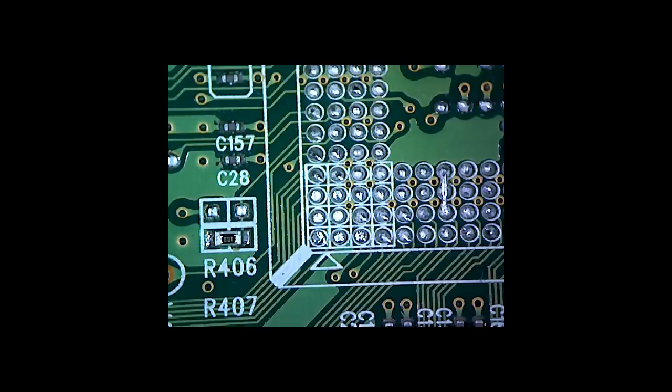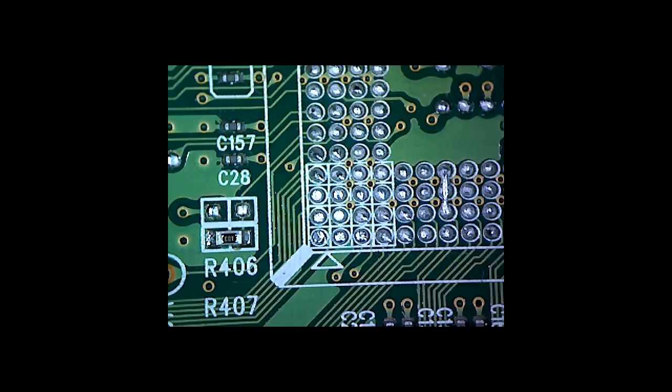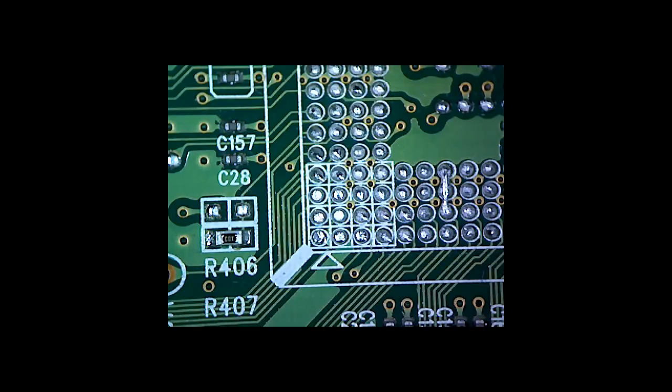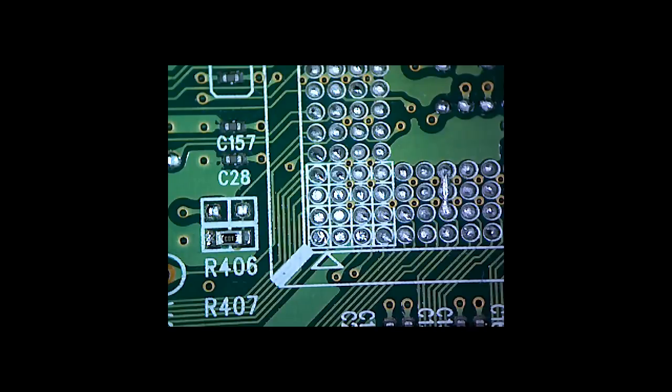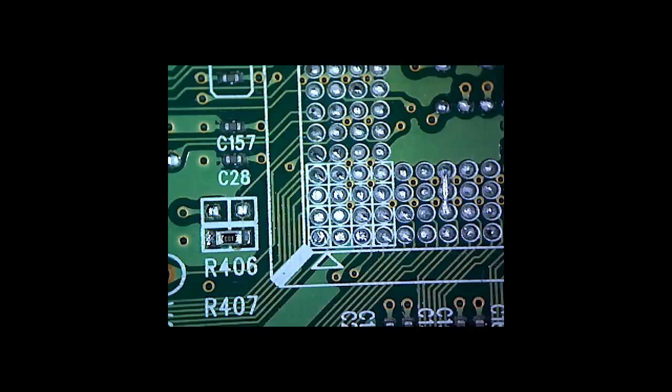There's a number of things to bear in mind with this. Firstly, you've got to pick the right option from the devices in the software menu. In this particular case, we have to select Venus USB 2 camera. I've also ticked the microphone from the laptop, an external microphone that I plug in for YouTube videos. You would also need to go to options and mess around with the various still capture pin, video capture pin, video capture filter and things like that. I've just realized that whilst this is recording I can't make any changes.